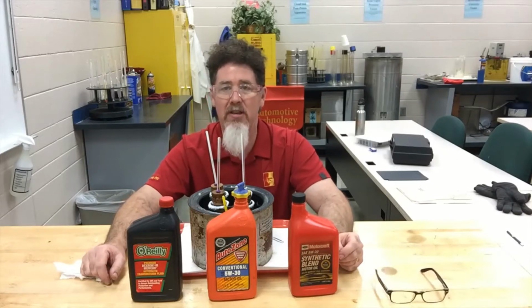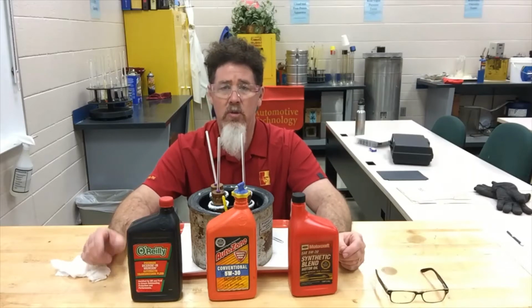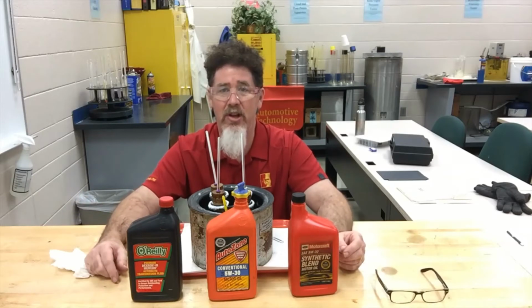We've been playing around today with getting automotive fluids down to below 0 degrees and seeing what happens to them. We've already tested diesel fuel, kerosene and biodiesel, and I get questions from students on occasion about their motor oil and their transmission fluid, and what happens to that fluid when you get down below 0 degrees.